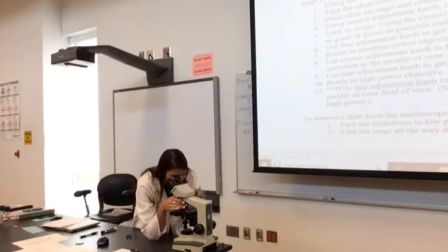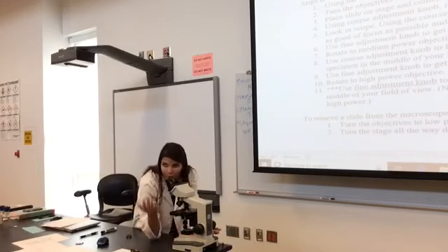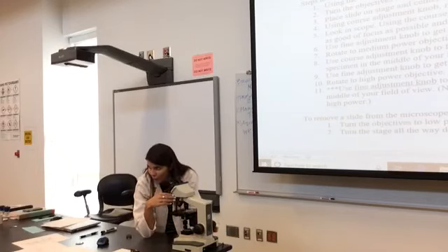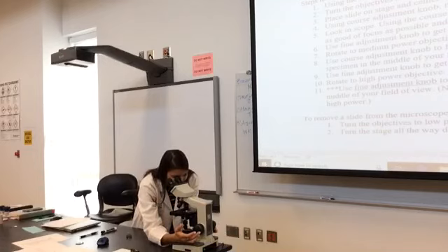So I'm going to go from low, I'm going to watch it, going to medium, it's blurry, I'm going to use fine adjustment, and I'm good. I can see it clearly. Like, I'm not faking. Everything I'm telling you is the truth. Then I look through here from medium, roll it to high. I can see something. It is not clear. Fine focus, and there it is. I'm going to move it towards the center so my professor can't be like, I don't see it.